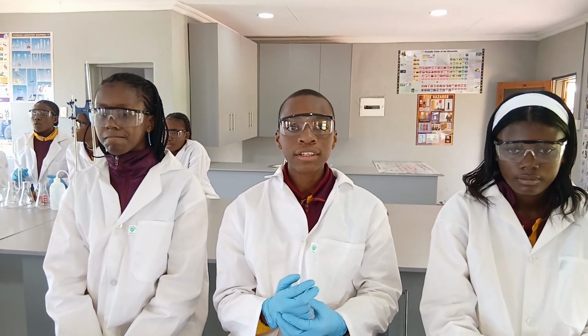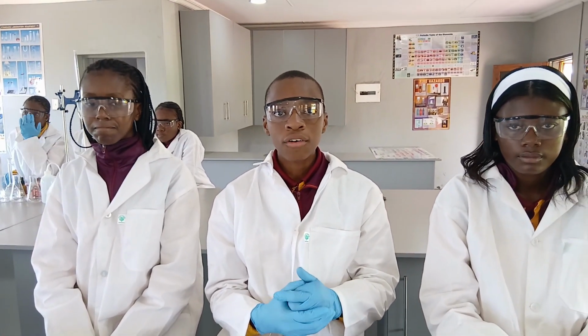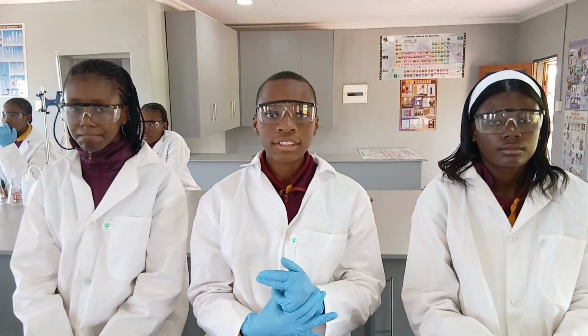To test if certain household substances are acids or bases, we can use indicators or litmus paper. We have several indicators: litmus paper, phenolphthalein, or universal indicator. Each one of these allows you to test if certain household substances are acids or bases. But I decided to use the universal indicator because it is the most reliable.